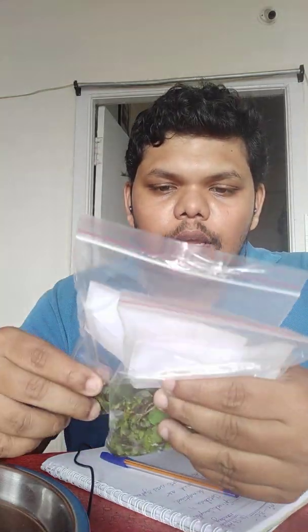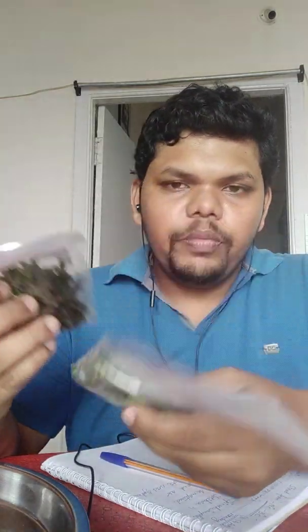So once I dry these samples out in the sun, I will get back to you and let's see how it goes from there. Some will go into a bowl of water where it will soak overnight or the whole day, from whichever time I place it till the next day, and then a pH test will be conducted.